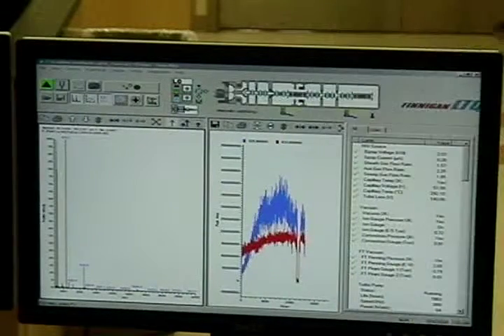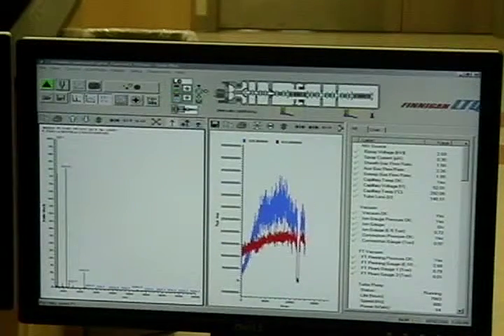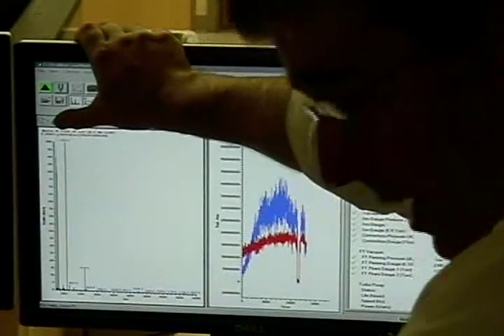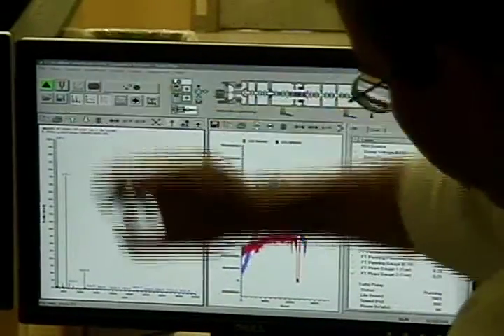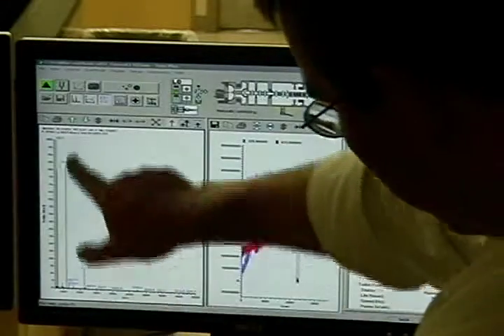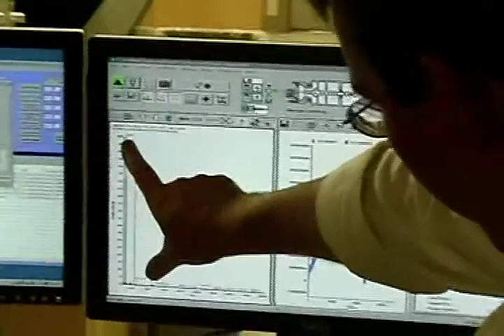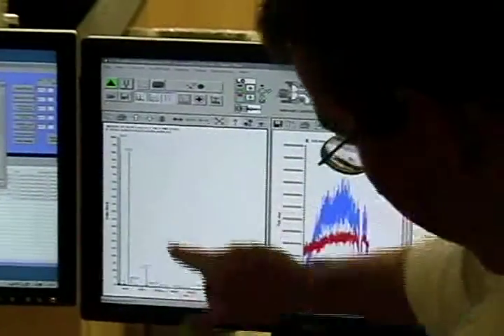Yeah, you have to do a control experiment with really good samples. It's hard to decide because you do get an overall size reduction. The problem with the trap is this signal height is not just the number of ions, it's the stupid time factor. So the question is, when this height is changing, are we changing the amount of 325 we're making, or are we just changing the 325 to something else?